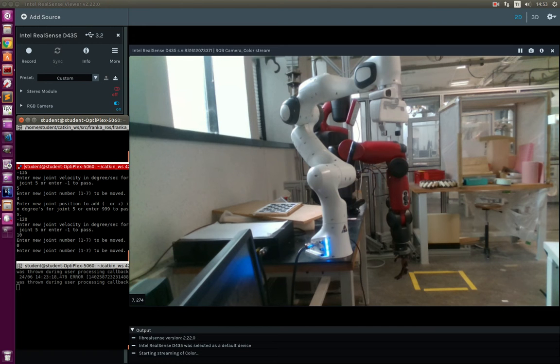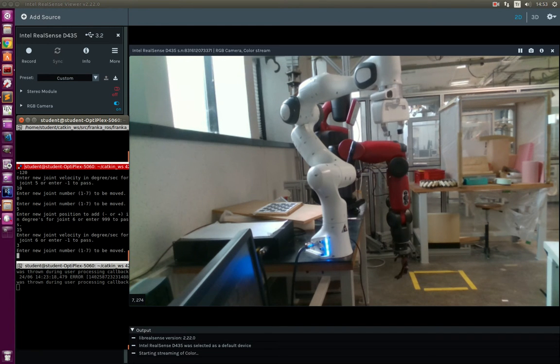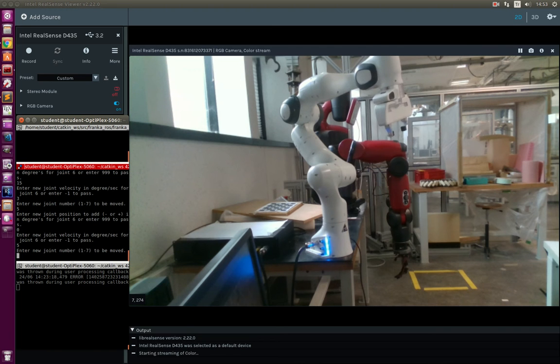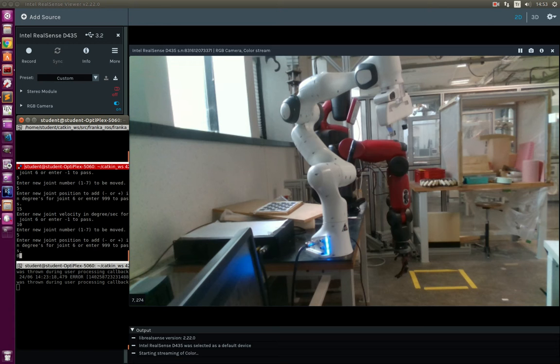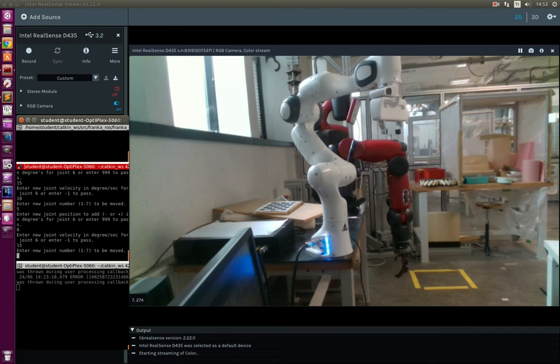Now proceeding with the fifth joint, sending it to 15 degrees with 3 degrees per second — not much a problem. Going back with 5 degrees per second — no problem. Again to 15 degrees, this time with 10 degrees per second — a small oscillation happened but not much of a problem. Let's try 15 degrees per second. As you can see, 15 degrees per second is not feasible to work with.